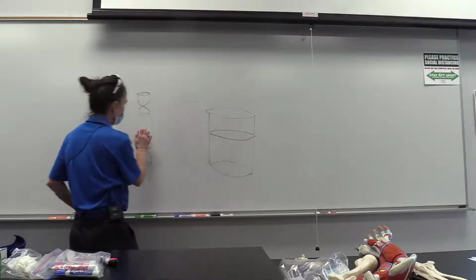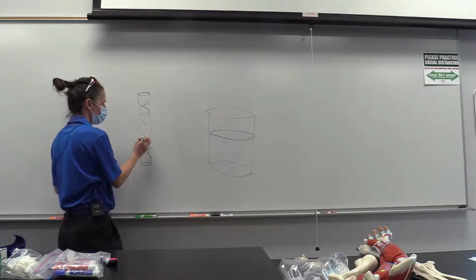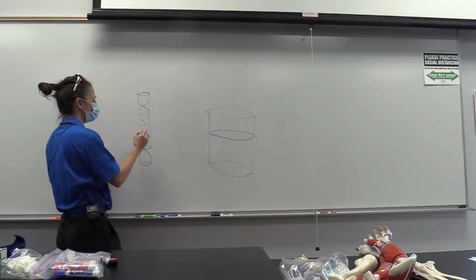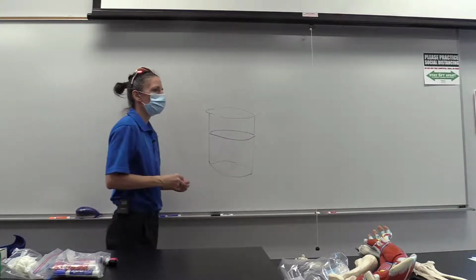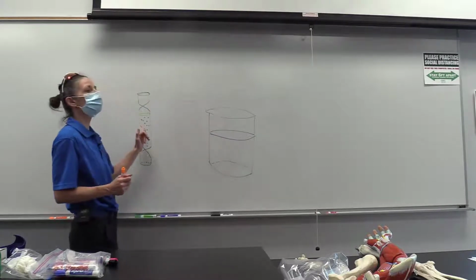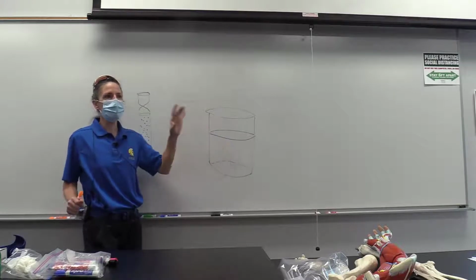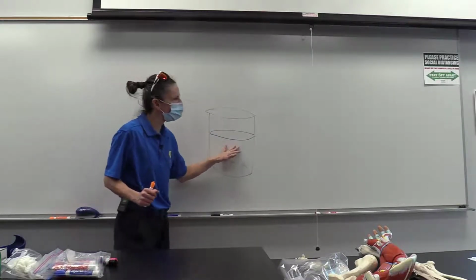So for our dialysis tubing up here, in some cases, we might have put in a starch solution or a sugar solution. And then we put it in distilled water, right? And if we put this into distilled water, then this is the hypertonic compartment, and this is the hypotonic compartment, right? Now it acts just like a cell. We can watch and see what happens over time.